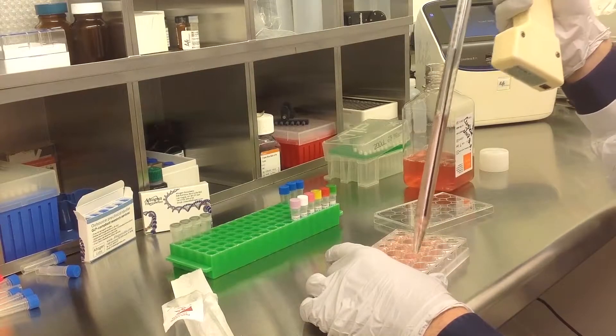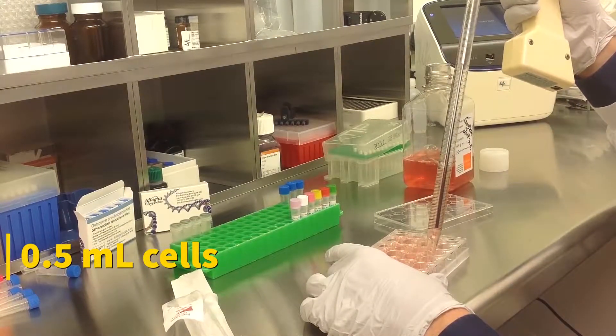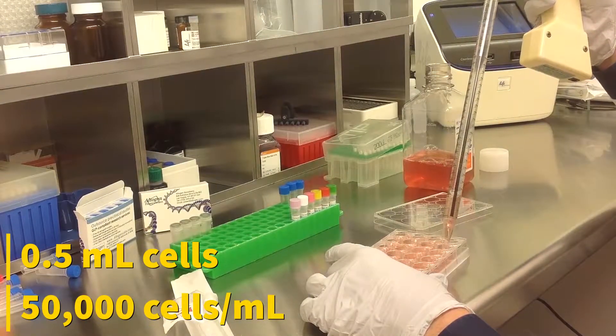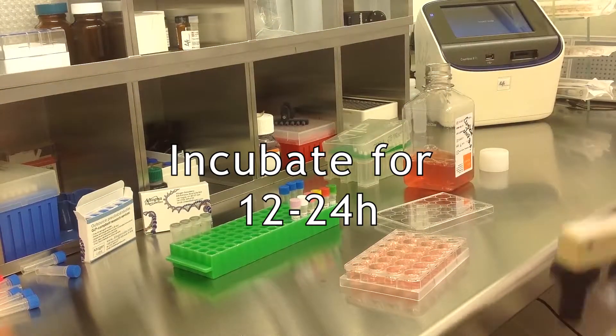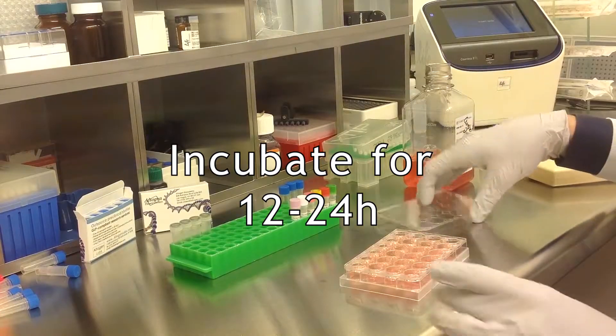Start by seeding 500 microliters of cells in a complete growth medium into the wells. Cell density should be at 50,000 cells per milliliter. Incubate the cells for 12 to 24 hours before transfection at 37 degrees Celsius in a humidified carbon dioxide incubator.